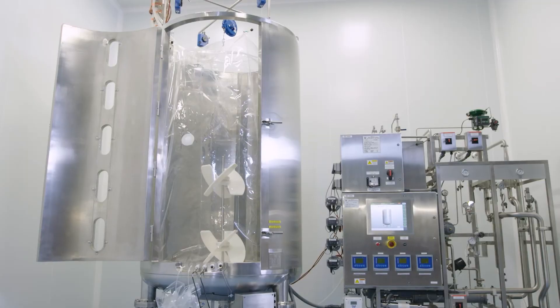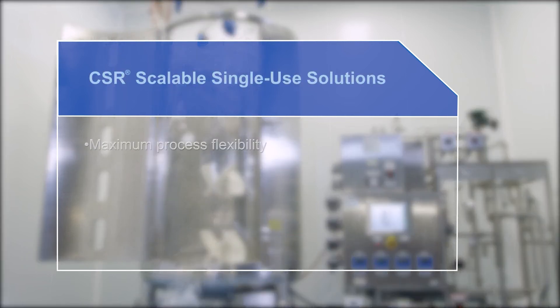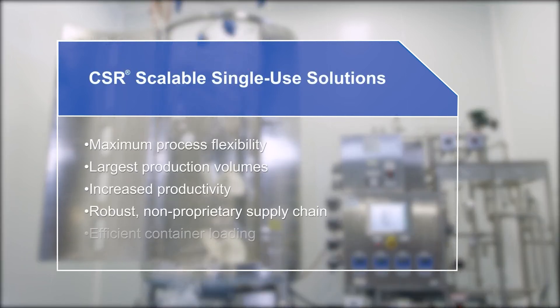ABEC CSR sets new benchmarks in single-use performance, offering maximum process flexibility, largest production volumes, increased productivity, robust non-proprietary supply chain, and efficient container loading.